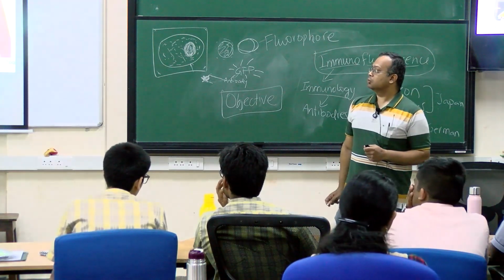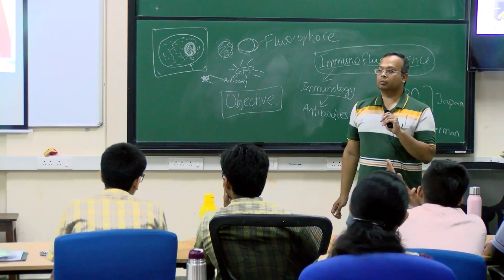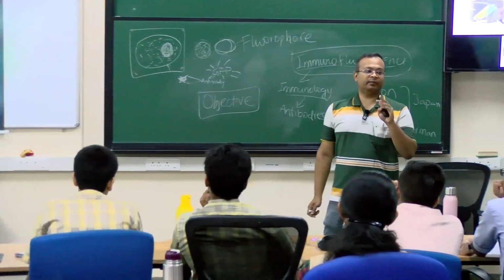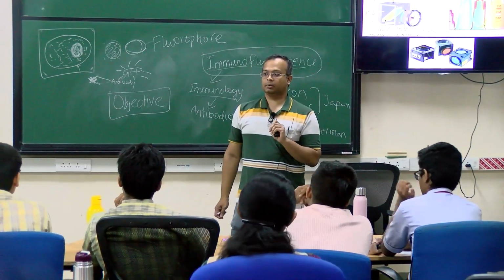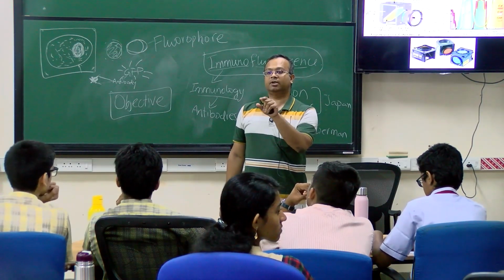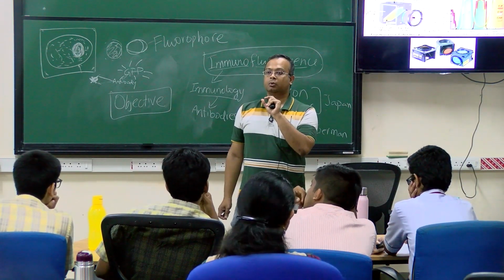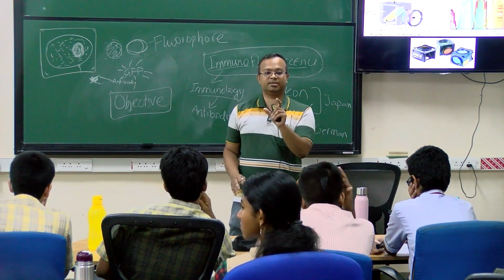Okay. So in a microscope, we also need some kind of filter. When we are seeing light of different colors, we are not seeing them together. Let's say I have 3 colors in my sample. I first want to see the blue color. So I will first shine UV light. That UV light will shine on the blue fluorophore, and it will give me the blue light. At that time, I don't want to see the green, I don't want to see the red, I will only see the blue.